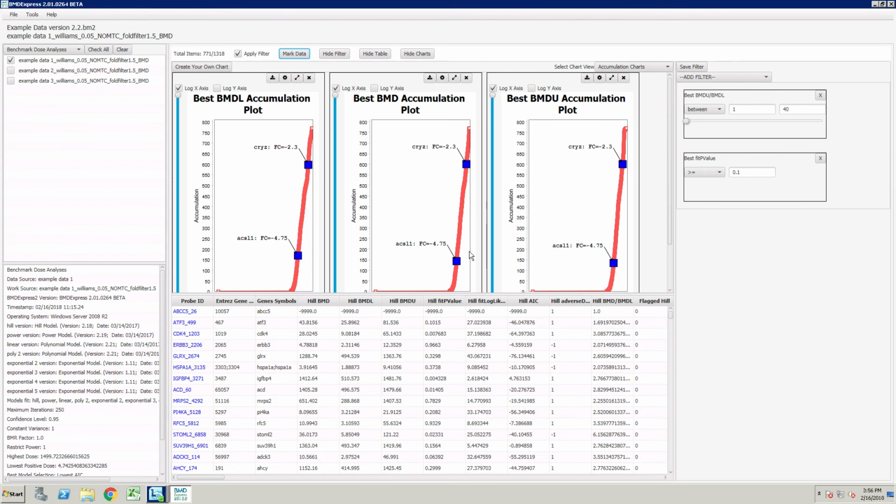If it's blue, it's down-regulated. If it's yellow, it's up-regulated. And these are all movable. You can move these around. So this actually carries through the rest of the charts too, where there's individual dots, and I don't think that actually there's any more diagrams that have those.